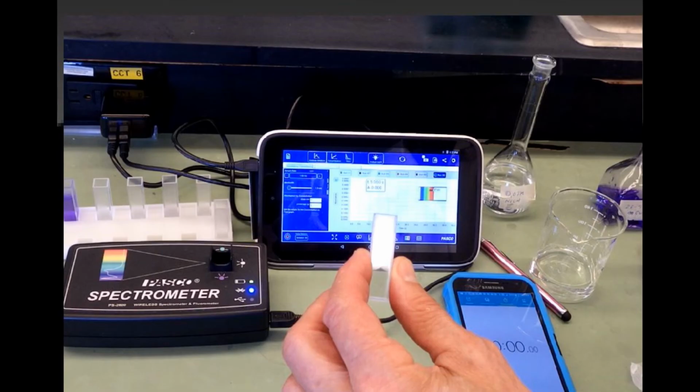In parts B and C of this experiment, you'll be working in the time mode, which is the tile that is third from the left in the top menu bar of the tablet. And in this mode, you'll be combining crystal violet and sodium hydroxide, and the color will fade. The y-axis of the plot is still absorbance, but the x-axis will now be time, and you'll see the absorbance declining over time.